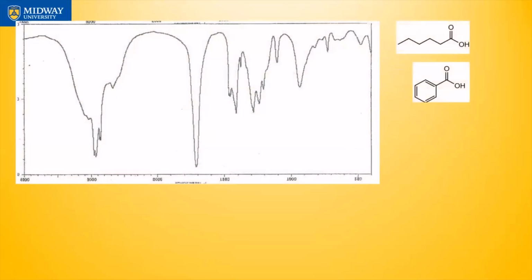All right, last and final quiz. Now here's what I was really interested in. What's difficult about this problem? Well, this has acid as well, right? In fact, I designed this and then went back and designed the previous one. You can see the resemblance of these two guys, right? In fact, I only had this and then I went back, found the spectrum, and then tried to reinforce this onto the previous one. And that slide became the first one. I moved it to a later slide.